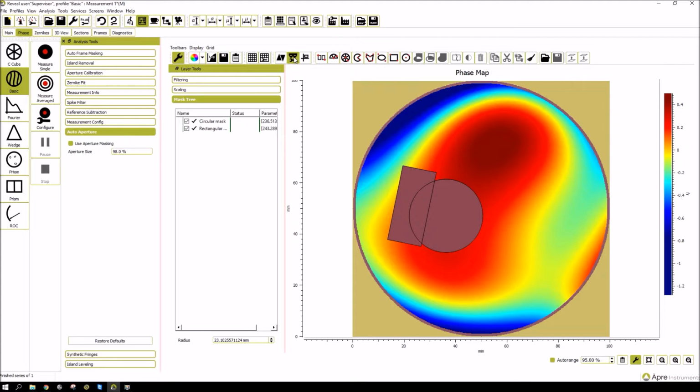So how do we combine these two into a group? If we have two exclude masks, which could be considered the basic mask, they're not inverted, or the complement as would be in set theory, by De Morgan's rule, if you have two exclude masks and you want to combine them, you do the union or the sum. So exclude masks, you sum them.